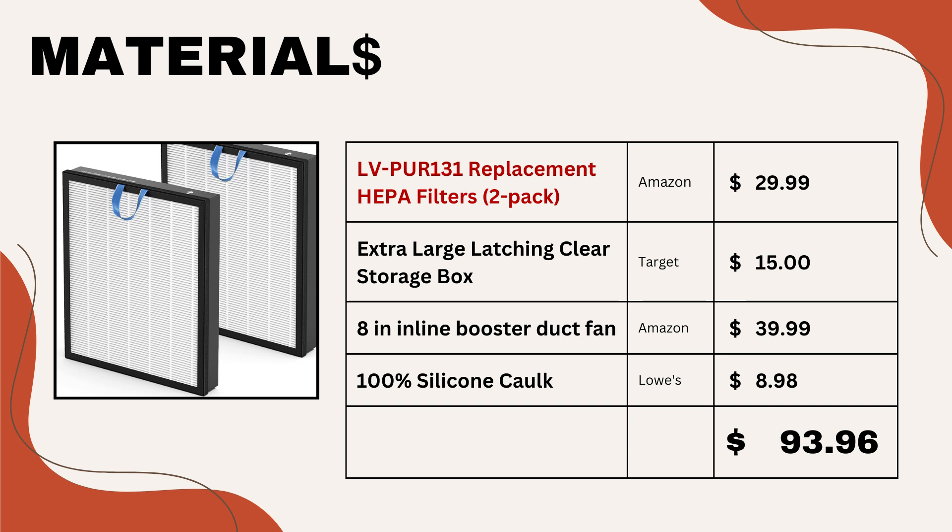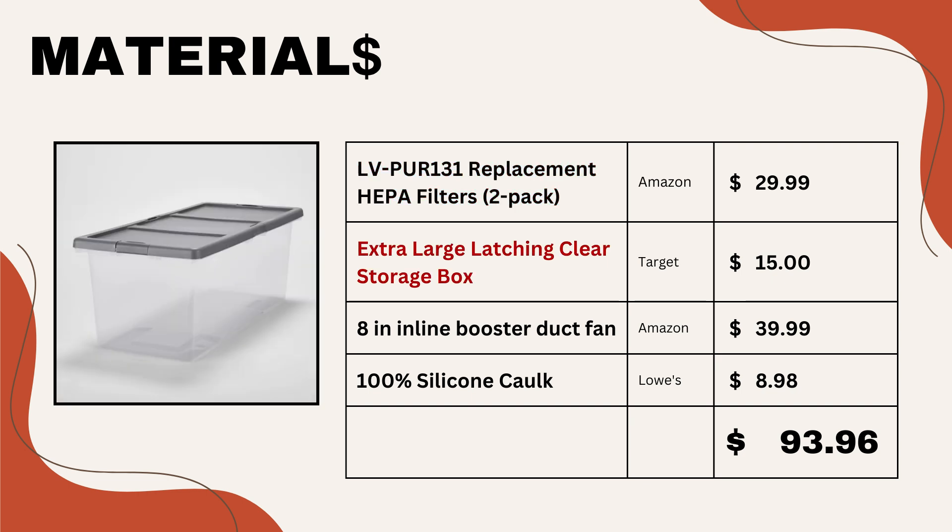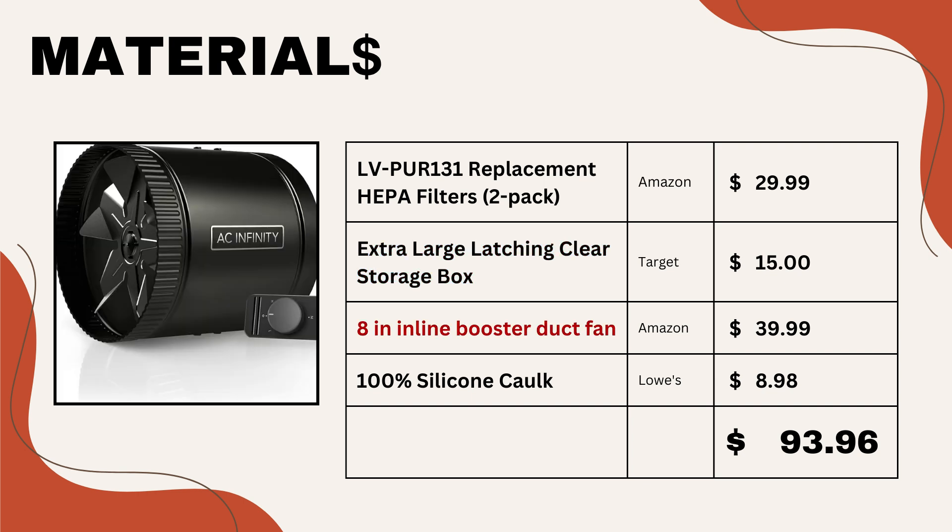Here's our shopping list. Most importantly, you need a good HEPA filter — I used the LB Pure 131 replacement filter. They cost around $30 in a two-pack from Amazon. Then we need a storage bin which is large enough to fit both of the HEPA filters comfortably. This eight-inch inline booster duct fan from AC Infinity works really well, provides really stable airflow, and it is quiet. The controller lets you fine-tune the airflow so that you can achieve laminar flow.